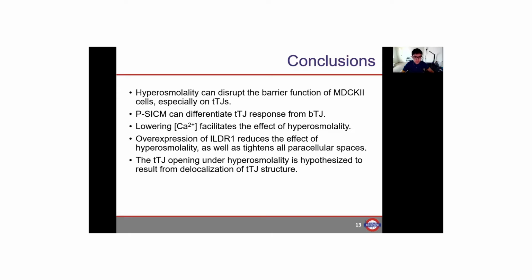To conclude my talk today, we use the PSICM technique to differentiate the response of tricellular junction and bicellular junction under the treatment of mannitol.